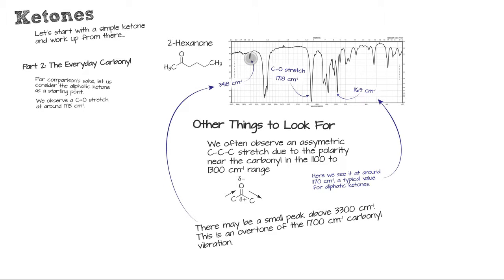Now, look right here. What do you see? That is an overtone peak. The overtone peak is the result of a doubling of this frequency right here. So basically it's a double transition. Instead of going from vibrational energy 0 to 1, we went from vibrational energy 0 straight to vibrational energy 2. Because remember, in the harmonic oscillator, such a transition is forbidden, but we are not in a real harmonic oscillator. This is actually the Morse potential. It's a little more asymmetric, the shape of the bond's potential energy well compared to the harmonic oscillator. We discussed that in a previous presentation. So what's happening here is you can have a very unlikely transition. Forbidden just kind of means unlikely in organic chemistry.